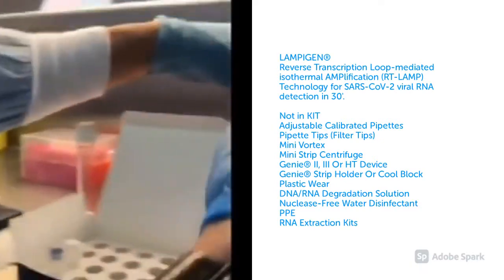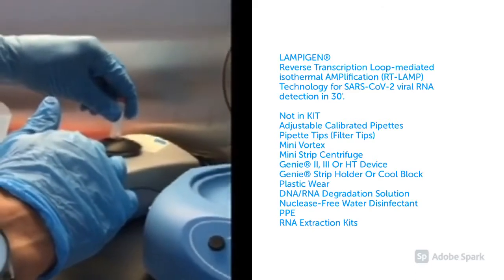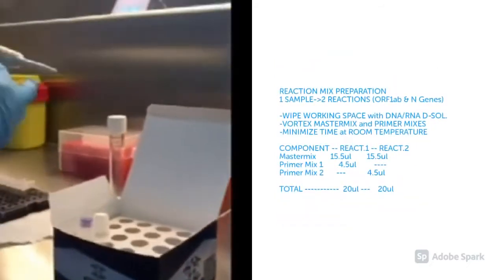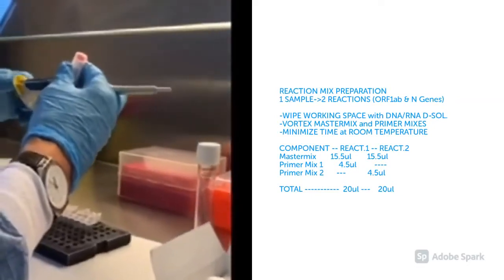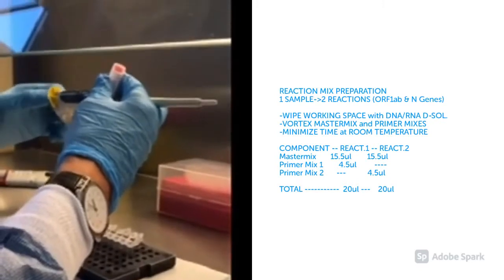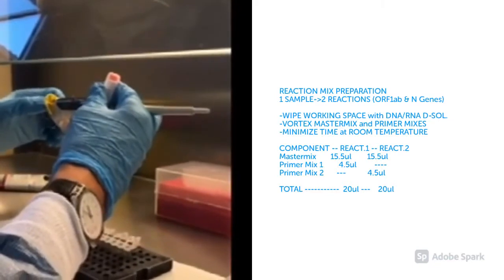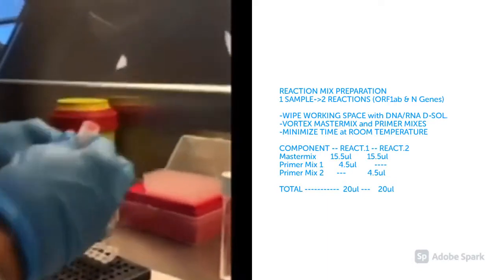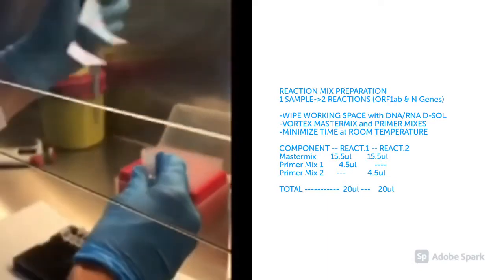And first of all, we are vortexing our master mix in here. And we get 15.5 microliters of master mix for each reaction. Here is 15.5, and for each reaction, for each test, we use 2 genes.